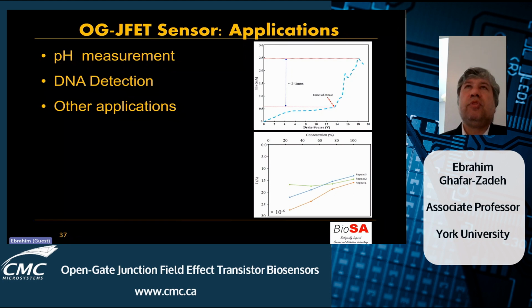In order to develop a device for cellular monitoring, specific attention should be paid, for example, to the size of the device, like width, length, and some other geometries. In addition to that, the surface of the device should also be considered as another important factor.